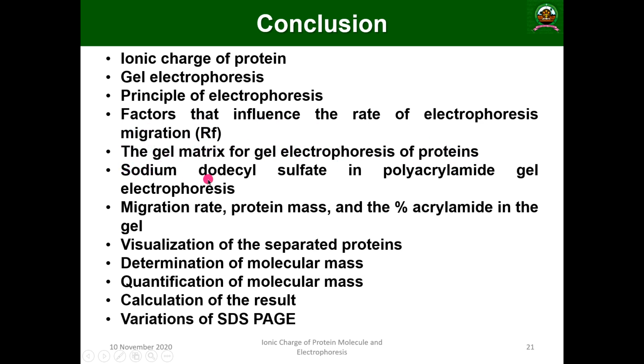Then what do you mean by sodium dodecyl sulfate, SDS? In polyacrylamide gel electrophoresis, what is the migration rate, protein mass, and percentage of acrylamide gel used for this process? And how will you visualize the separated proteins? How will you determine the molecular mass? And how will you quantify the molecular mass?